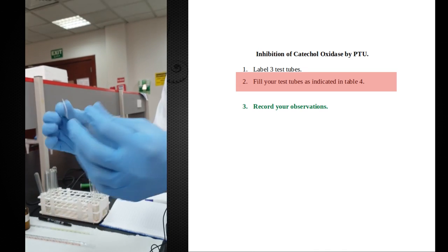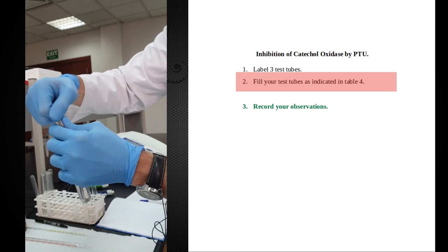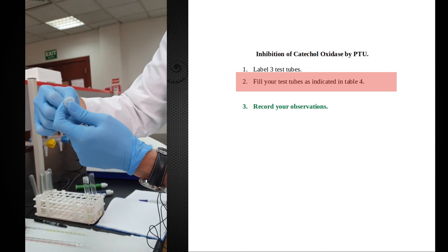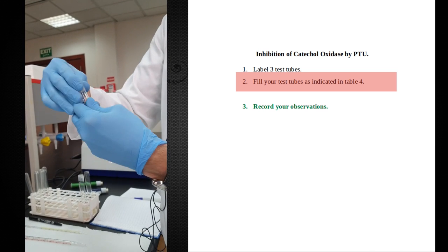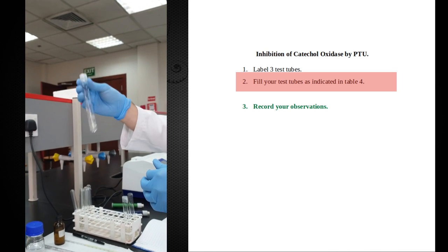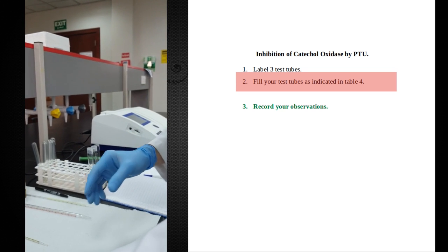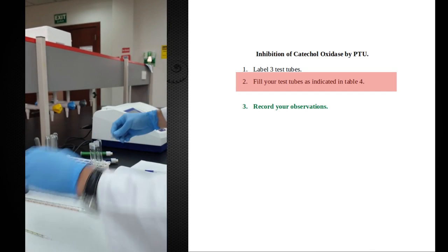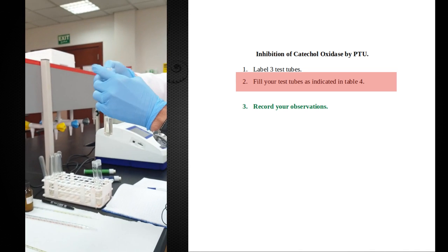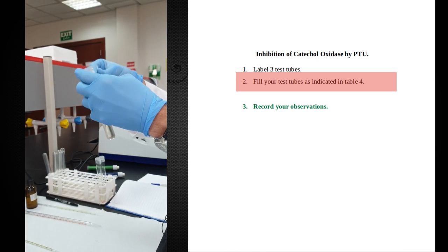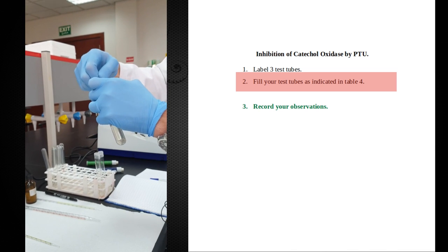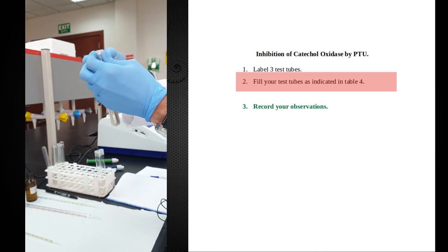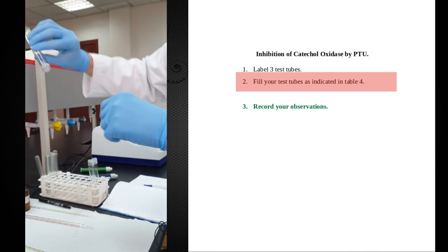I can stretch it either here, or directly on the tube. I can just pull my thumb over one corner and pull across. The trick is to make sure it doesn't rip as you're pulling. The key is that you need to stretch this stuff. It doesn't stick to things if you don't stretch it. You have to stretch it before you use it. These two test tubes are done. Let's do one more. This one ripped a little bit, but it's still okay.